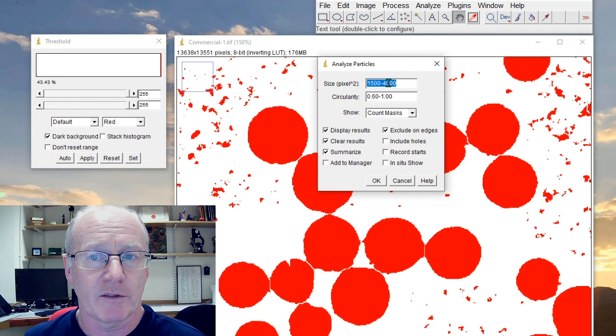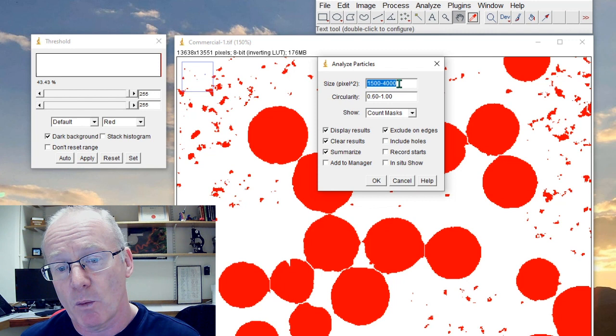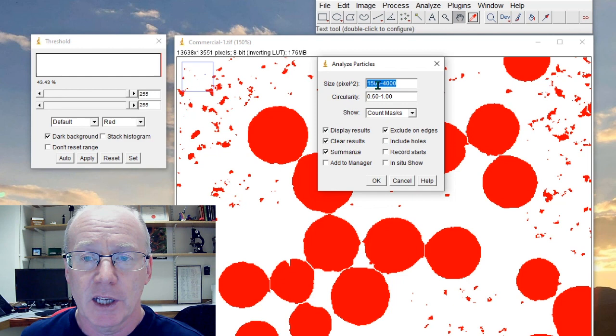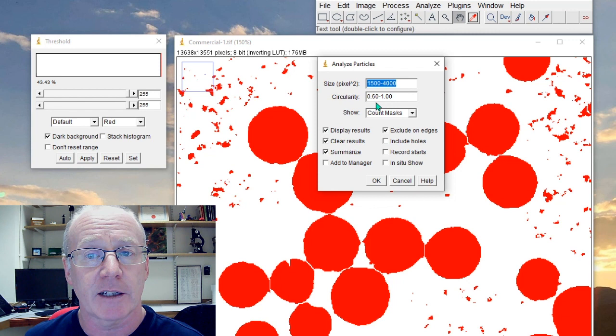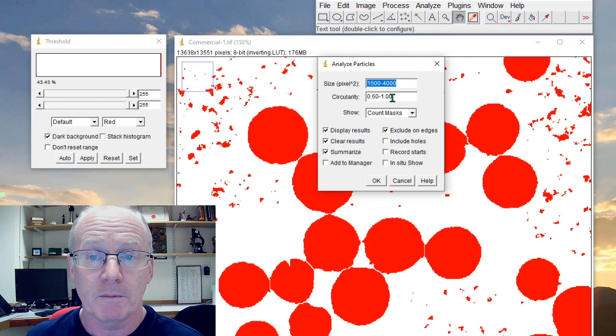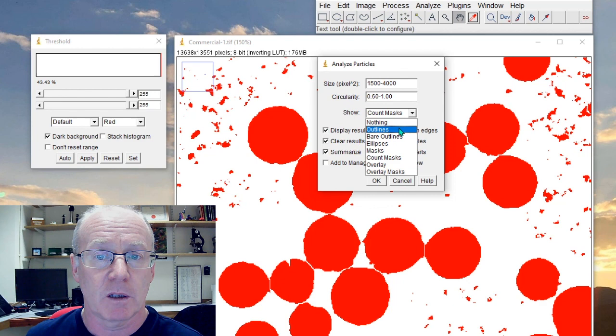Any object, any individual object which doesn't have a circularity of between 0.6 and 1—remember that perfect circle gives us the value of 1—will be excluded. And let's look at the result in outlines.